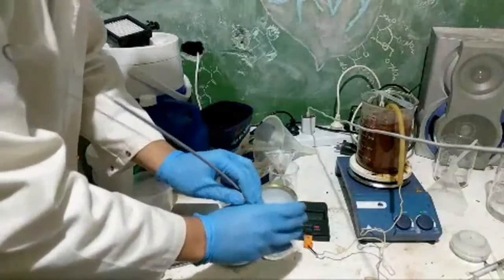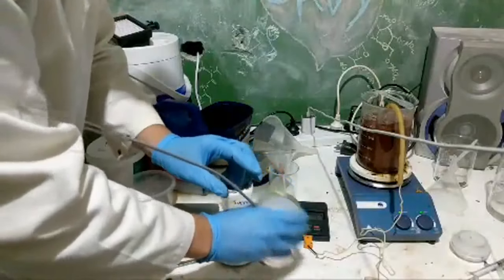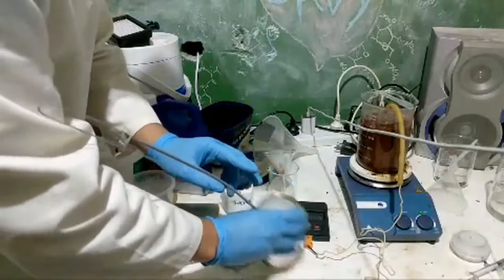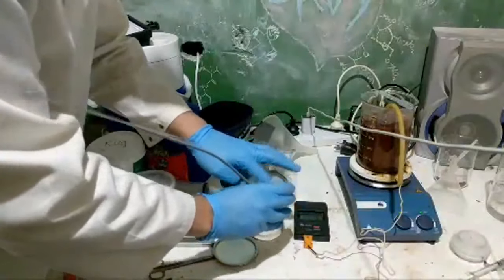Alright, I'll just give that a little bit of a shake so that it stays mostly at the top. Lucky.